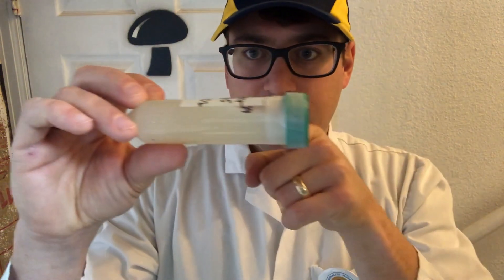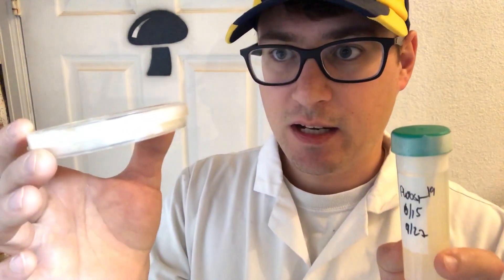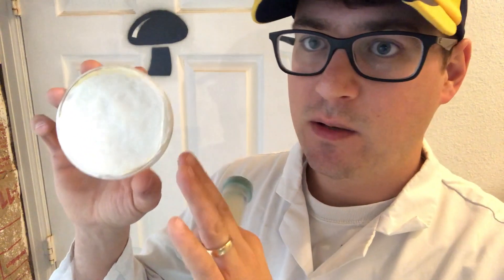It's called a slant because when you dry the agar, you put your test tube rack at a slant — or as shown in my previous videos, I use small metal rods to create a nice slant. The reason for the slant is to increase the surface area of the agar for growth. A petri dish also has a lot of surface area, which is good when you're isolating or taking wedges.